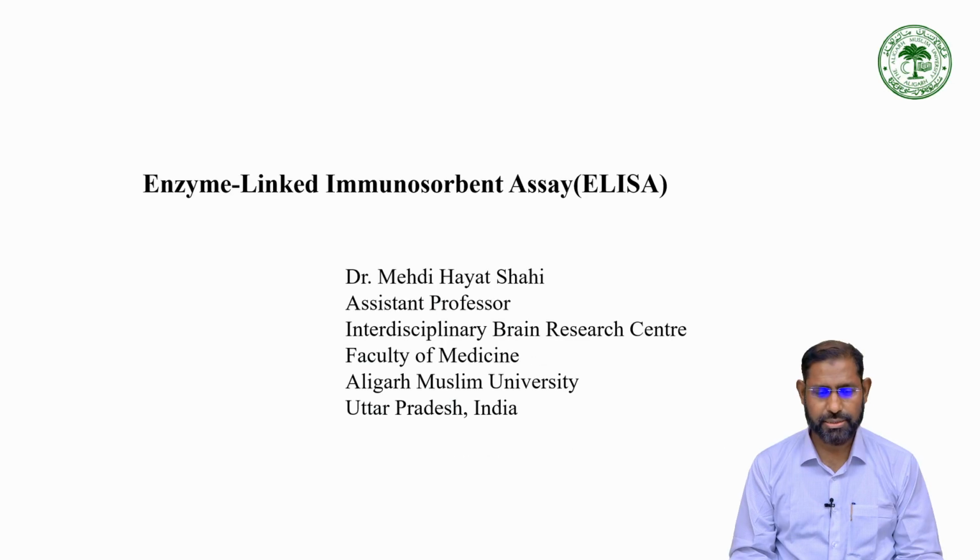Hello, dearest friends. Now is my last lecture of my third week. It is the 15th lecture. I'm talking about enzyme-linked immunosorbent assay (ELISA). It's a very specific technique to detect proteins in solutions, and it has very high sensitivity.